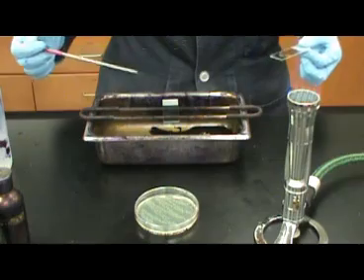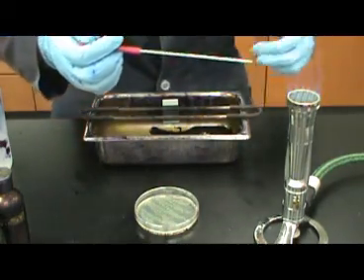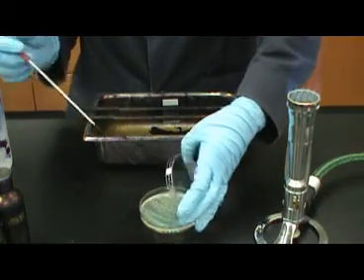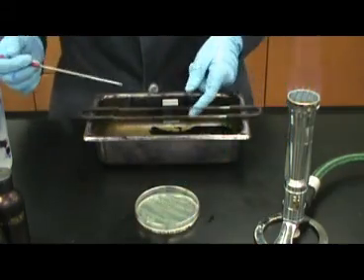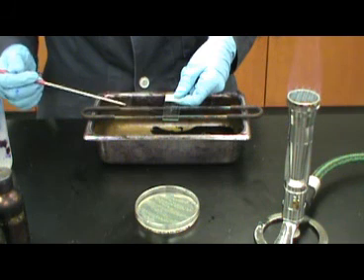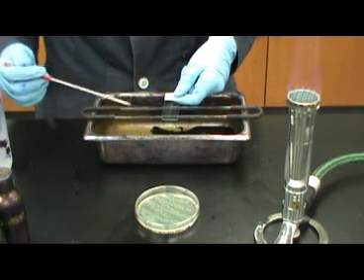Preparation of the slide for staining is very important. The first step is to add a small loopful of water to a clean slide. Sometimes, when slides are packaged, they can have a coating on them that prevents them from sticking together. You may want to wash your slide with soap and water prior to use to prevent the beading of the water when you are trying to mix the bacteria.